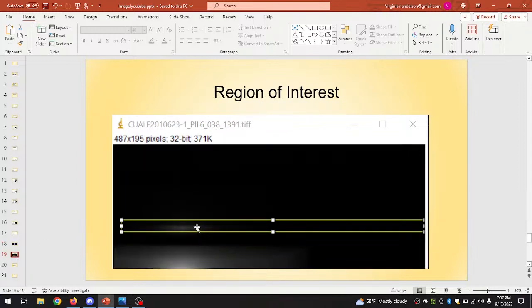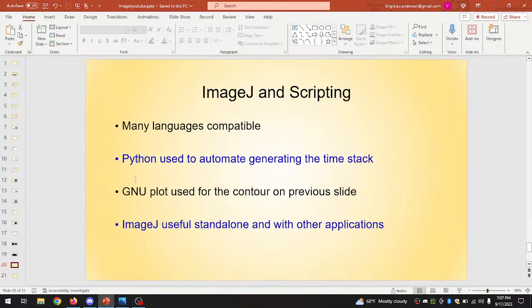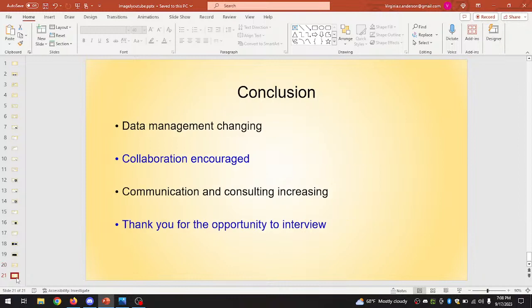In this case, this is the black and white image of scattering off of a surface. It's not adjusted very well, so it's very faint that you even see that there is some kind of X-ray hitting the detector. And it's just the very start of what could happen. I do plan to do a later video with more detail, but I want to point out that ImageJ as a picture analysis program is very, very useful and powerful, and can be integrated with so many other things that it makes it extremely useful.